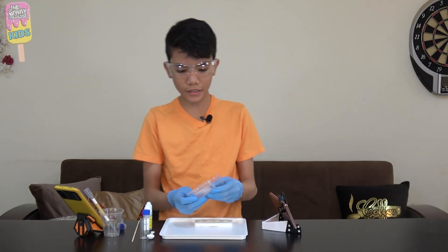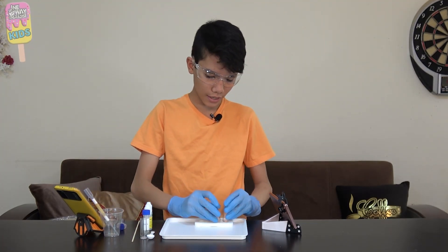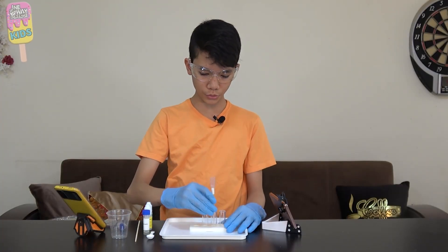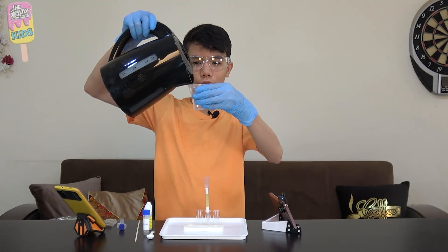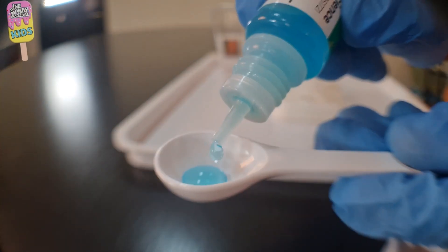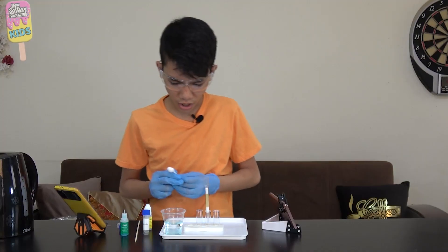We're gonna take three vials and insert them into our test stand just like this. I'm gonna insert our filter into the second vial. Then I'm gonna pour the disposable cup halfway with water and add one big spoonful of copper sulfate. Wow, it stinks!